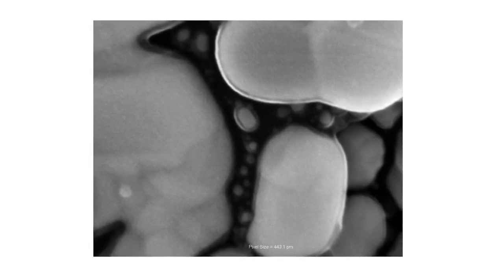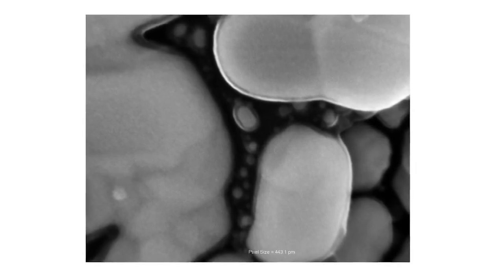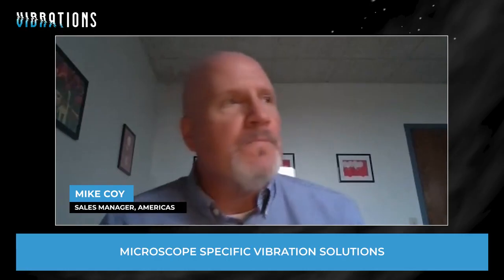Now, when you step up to an SEM, SEMs have come tremendously far in the last 30 years. A million X in an SEM now is quite possible. And the biggest difference between an SEM and a TEM is that an SEM is a surface analysis tool. You're looking at the actual surface, and it's what I like to call a real image of a material. You're looking at ups and downs, hills and valleys. You're looking at what your eye could see if you really could zoom into that ant down in Manhattan, right? That's what it would look like. It would look like an ant still.